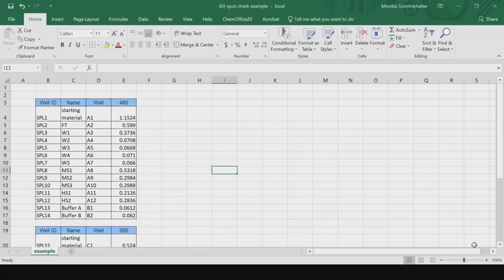In this recording, I'm going to demonstrate the analysis of the ion exchange experiment that you performed in the lab with these syringes and the HiTrap Q columns. The data that was collected was based on the assay for PPO activity with the substrate dopamine.